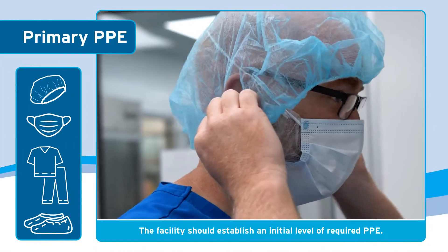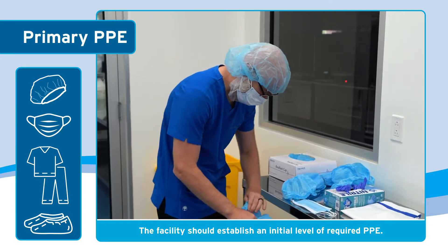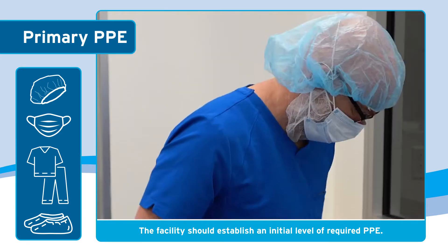The facility should establish an initial level of personal protective equipment to be donned, such as a facial hair covering, mask, hair bouffant, and shoe covers.